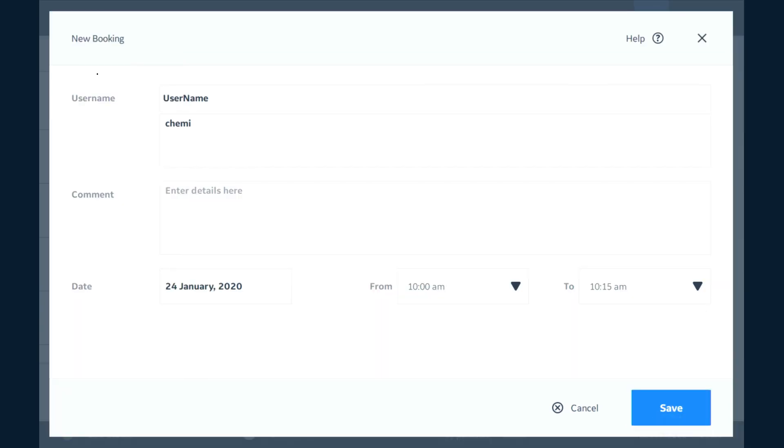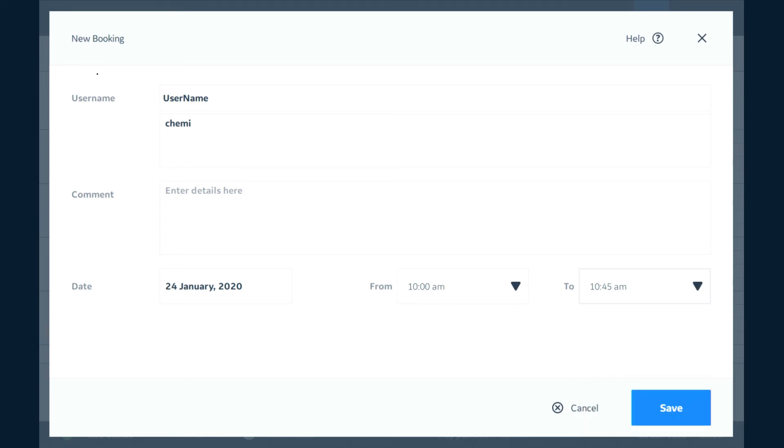Hit OK. Now we have a start time but now we have to create an end time. So I'm going to say I want to finish at 10:45. We're going to hit save.